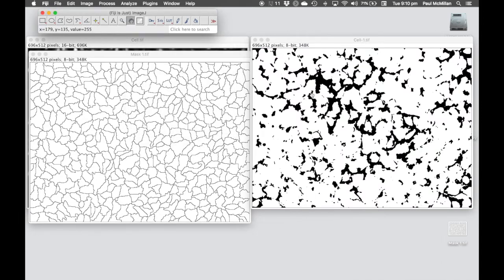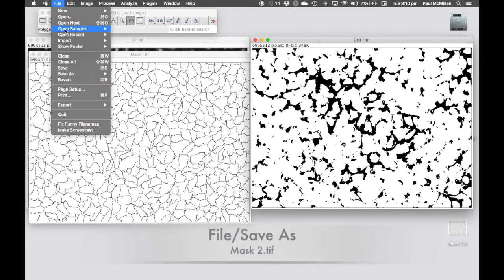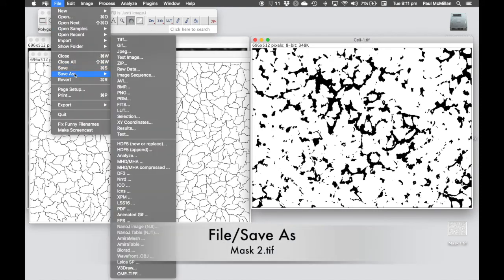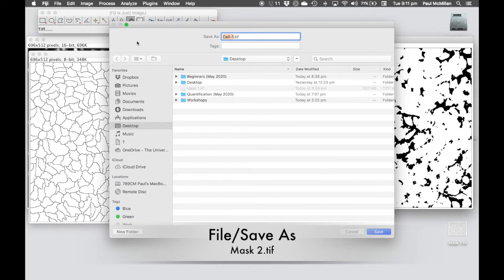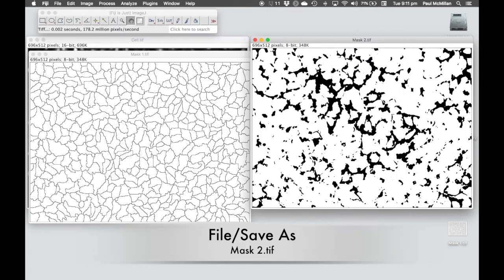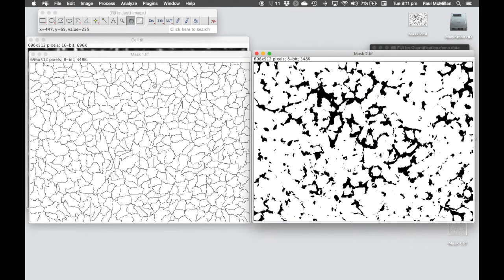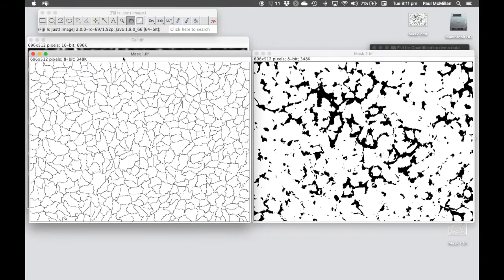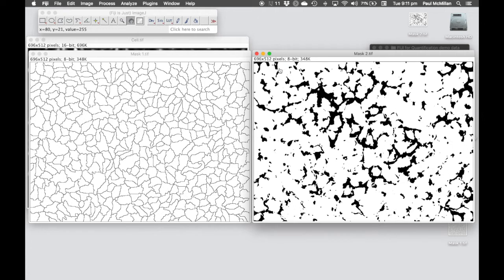Let me save that, that's mask2. In this case, we've got mask1, which is showing the gaps in between the cells, and mask2, which is showing the kind of footprint of the cells, where they sit within the image.